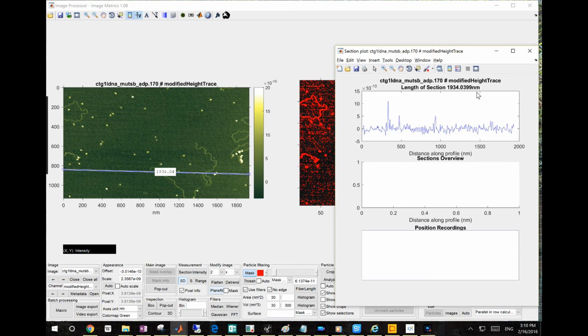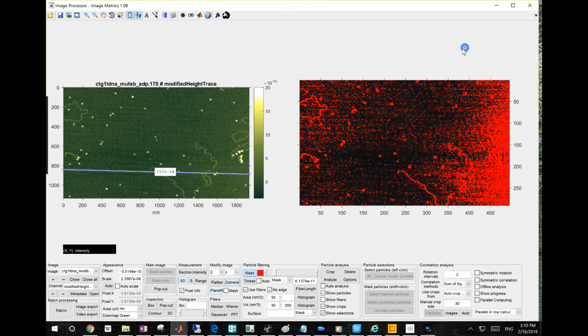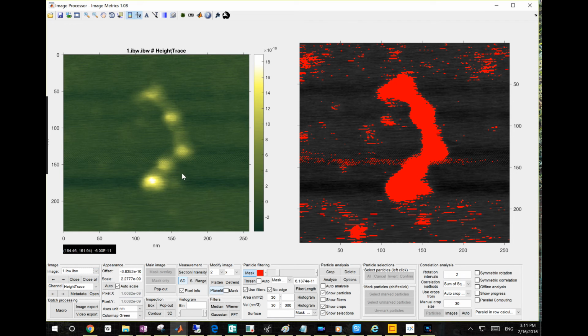Okay, so that's so much for the image correction, the basics. We also have corrections using Fourier transform. So now this comes to my third example, which is a periodical one. Let's just upscale this first. Let's go to another example first. For this example, you see that there's a lot of periodical noise in this line here. See that line? There's so much noise there.